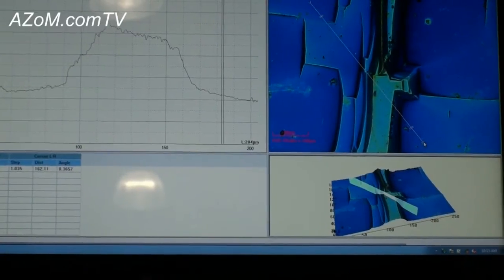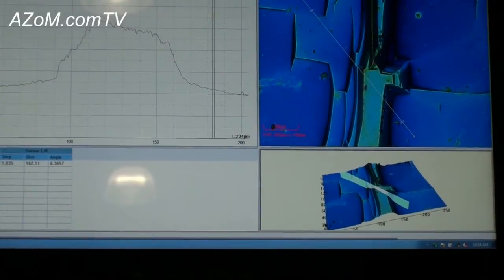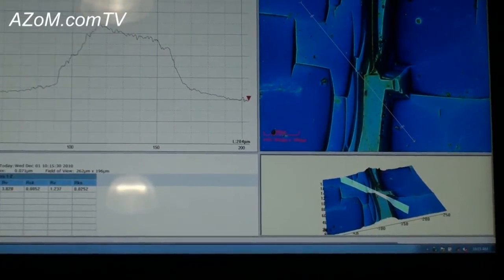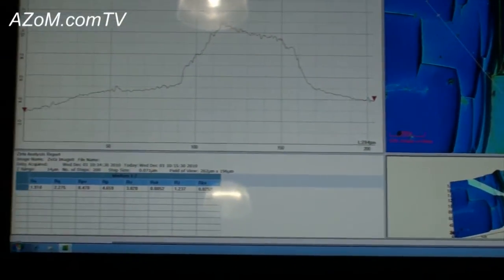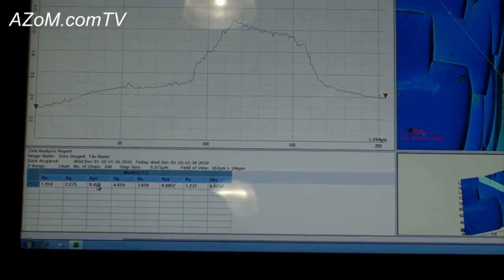If this were a sample and I wanted to measure roughness, it's as simple as coming up and clicking roughness. Now I actually have roughness values such as your average roughness, the RMS, peak to valley.